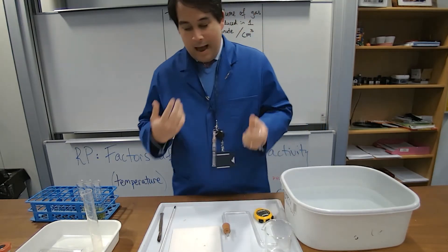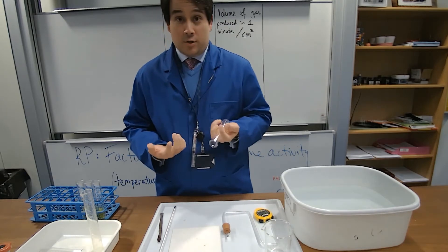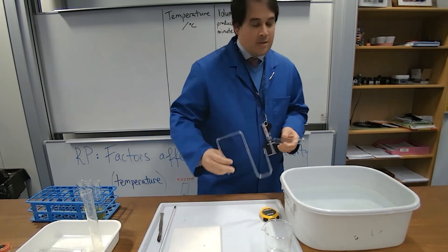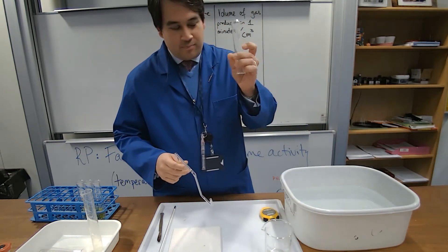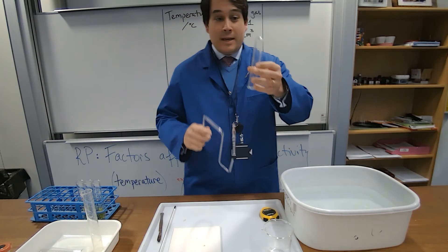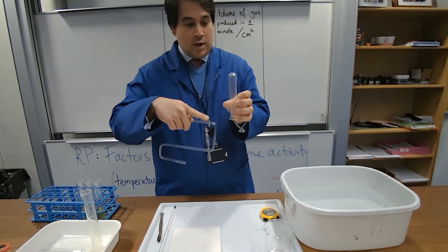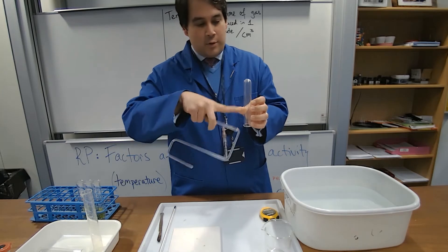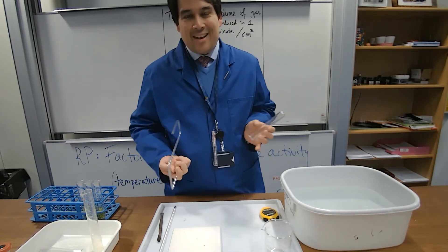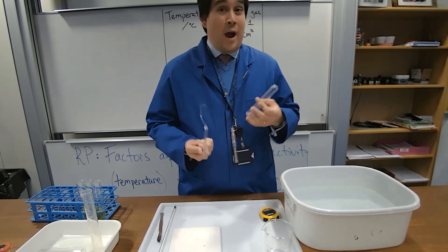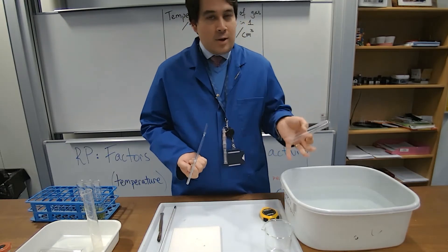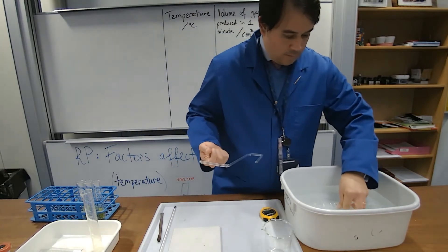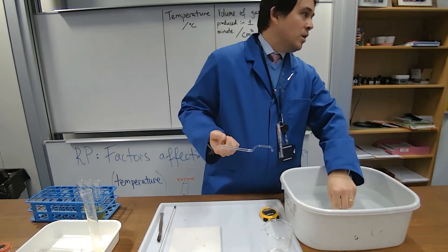Now, how do we calculate, how do we capture the oxygen? We're going to use water displacement, which means I'm going to fill this tube up with water. As you can see, it has graduated to a certain extent. We have some arbitrary units up. I'm going to say they are centimeters cubed. They're not quite, we could be more accurate by using a gas syringe, but you know, make it simple. Okay, so we're going to fill this up with water. I hope this works. I hope you can see that.